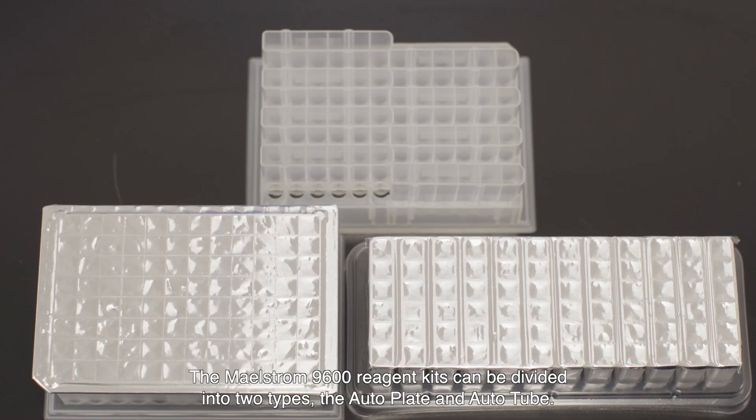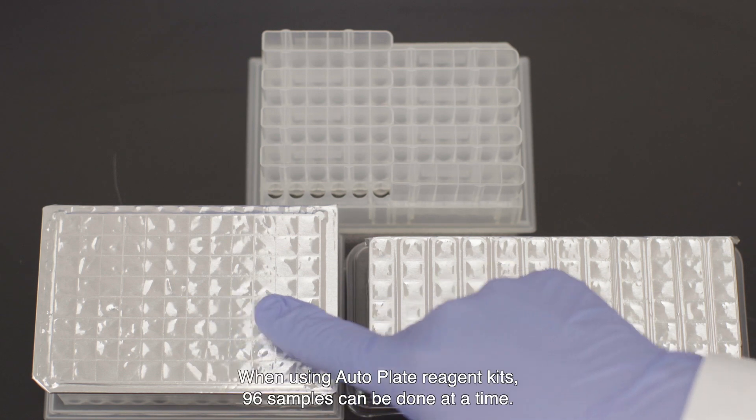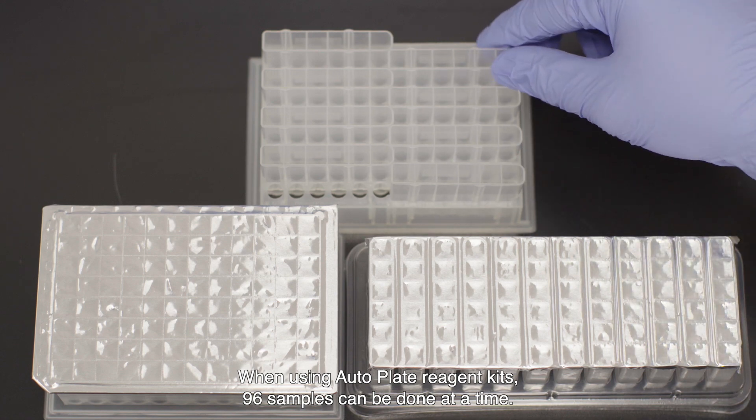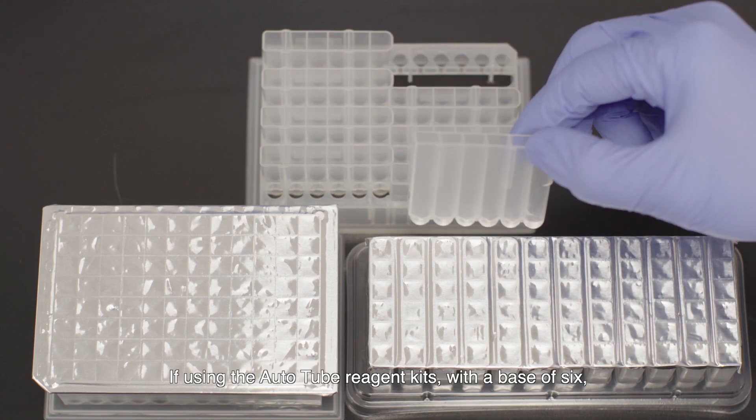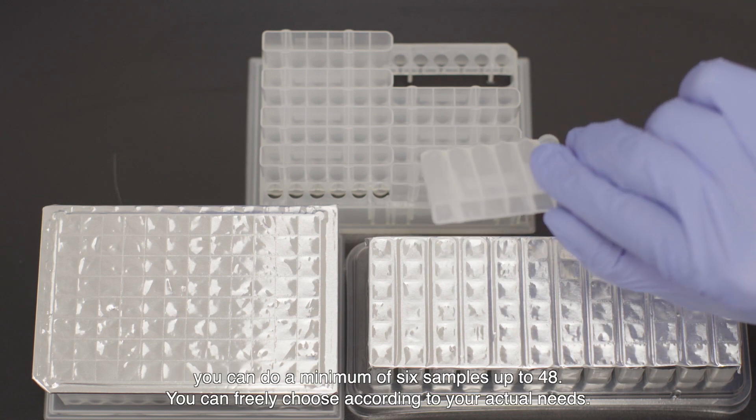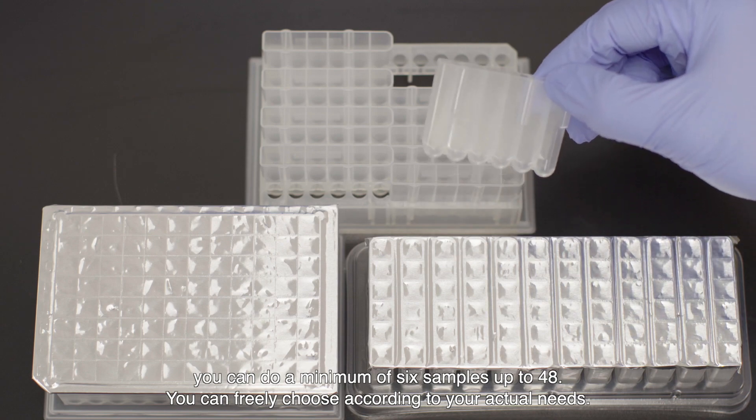The Maelstrom 9600 reagent kits can be divided into two types, the auto-plate and auto-tube. When using auto-plate reagent kits, 96 samples can be done at a time. If using the auto-tube reagent kits, with a base of six, you can do a minimum of six samples up to 48. You can freely choose according to your actual needs.